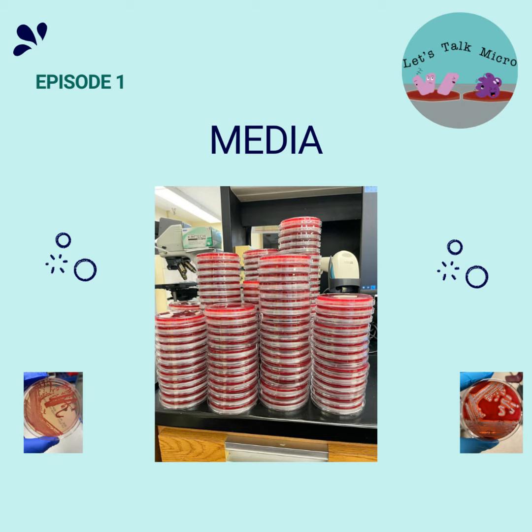And then once we have the sample on the plates, what do we do with it? Do we leave it like that? So the answer is no. By adding the sample, we inoculated it, and now we have to streak it. So with a loop, we streak, and then there are two types of streaking. You have your isolation streaking, what they call the 4-quadrant.